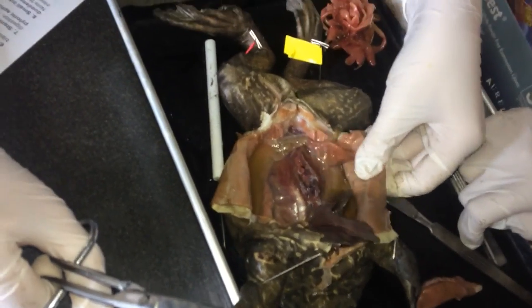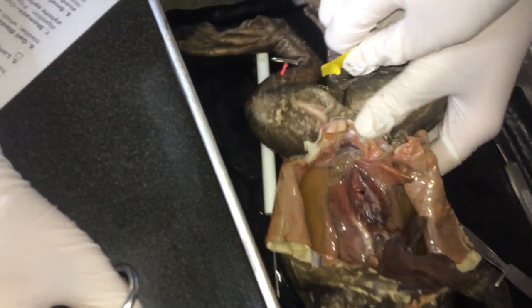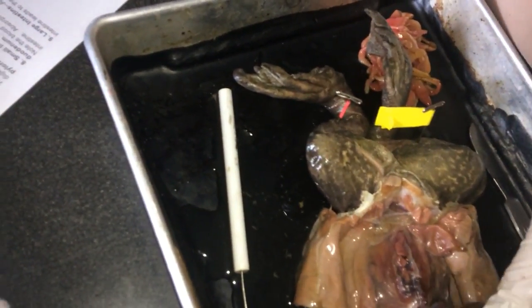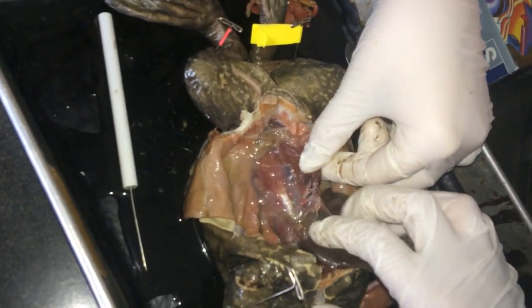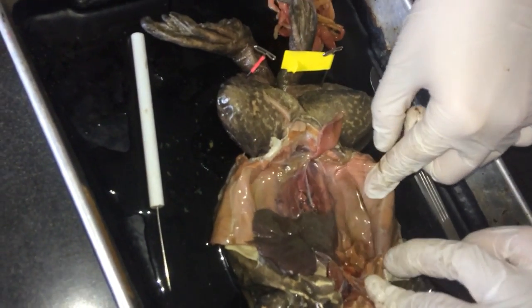Can we dump out some of this stuff? Okay. So there's the liver. There's the lungs. Where's the kidney? I don't know. Does it not have a gender? Is it a genderless frog?